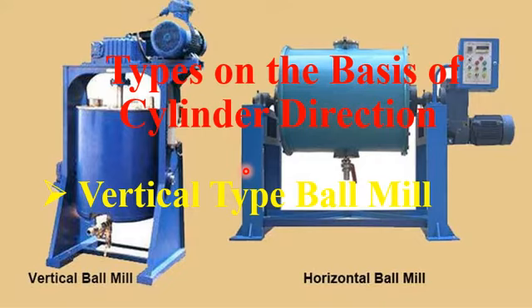Okay, so it is a very suitable type of ball mill machine if you want to prepare a very finely ground material having high purity.